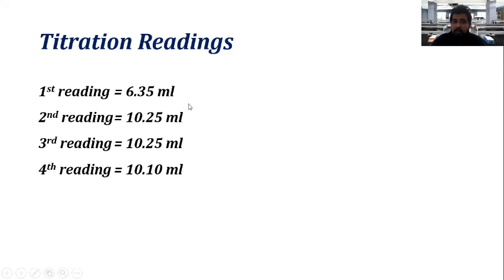Then we have to disregard the readings or whatever measurements we took when we did something wrong. There can be errors in every chemical experiment. If the error is not at an acceptable level, we have to disregard the measurements or the readings. So that's what happened here. Maybe we have underestimated the endpoint. I think that's the answer to your question.